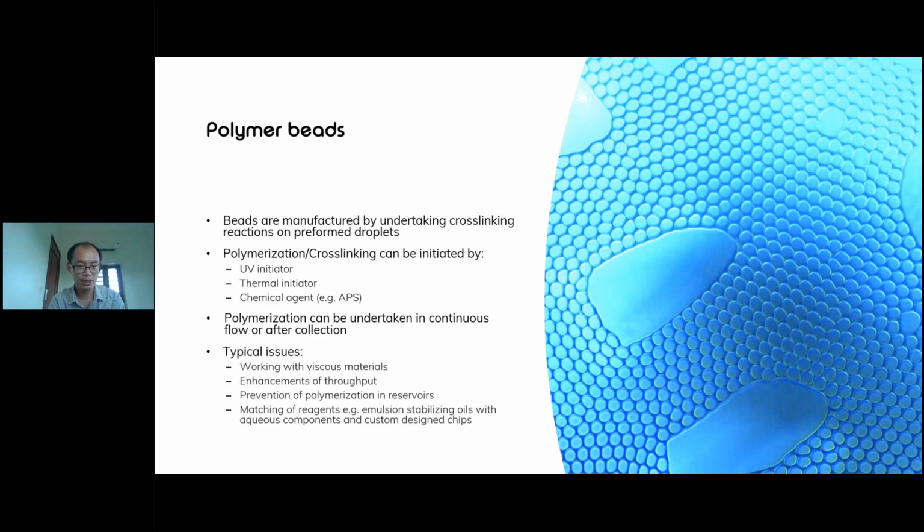The typical issue may come from working with viscous materials. It can increase the back pressure and flow resistance.